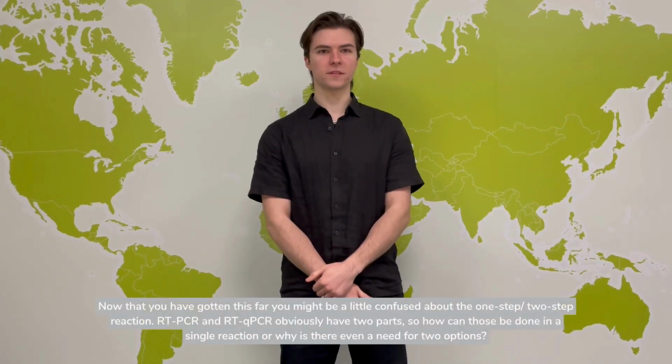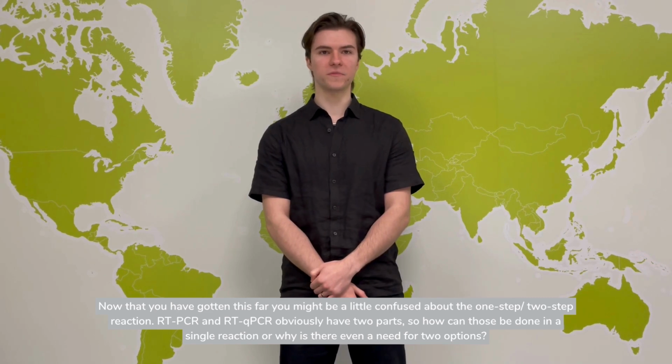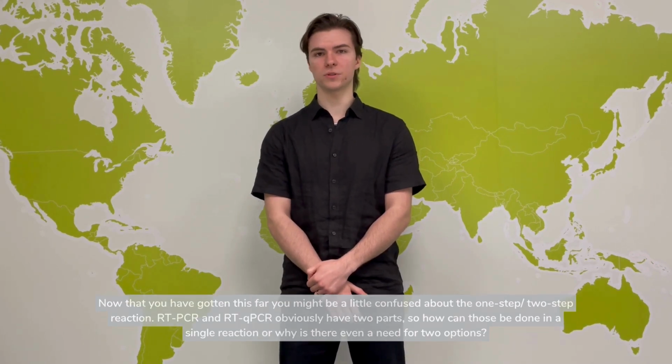Now that you have gotten this far, you might be a little confused about the one-step and two-step reaction. RT-PCR and RT-qPCR obviously have two parts, so how can those be done in a single reaction? Or why is there even a need for two options?